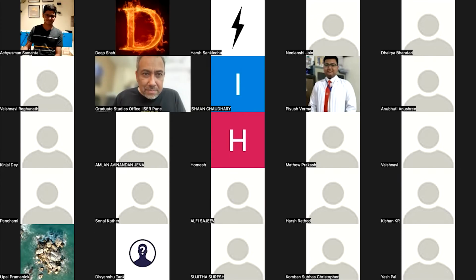So when you see this image in a regular confocal, you will not only see this, but all the light around it, like a fuzzy structure. You will have a region that is brighter than the rest, but it is still fuzzy. Deconvolution will clean all that and leave you with a more crisp image. Now, this is a very oversimplified way of describing it. Maybe we'll go to the next question and then come back to Achushman.